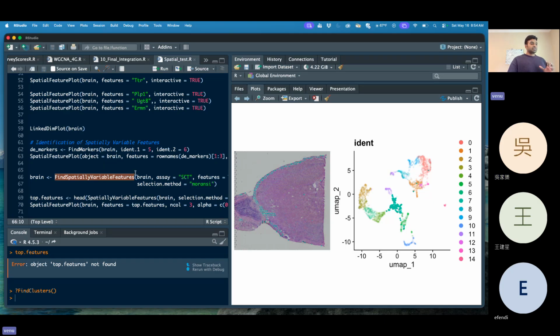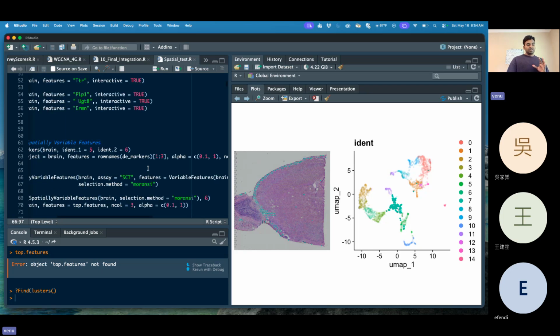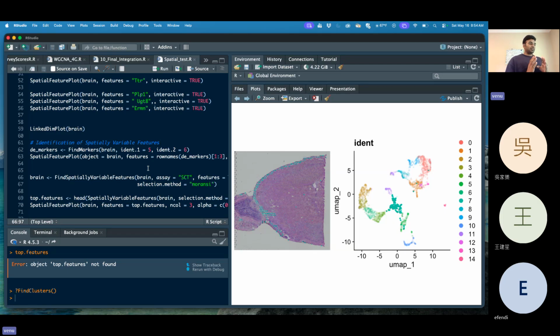Yes. So it will study the top 1,000 genes, because these 1,000 markers in one spot are similarly expressed in another spot, so they mix as a single group. It also considers where the spot is located. Suppose there are two spots that are away from each other, but their top 1,000 gene expression matches. Even though they are away from each other, they are considered a single group of spots.